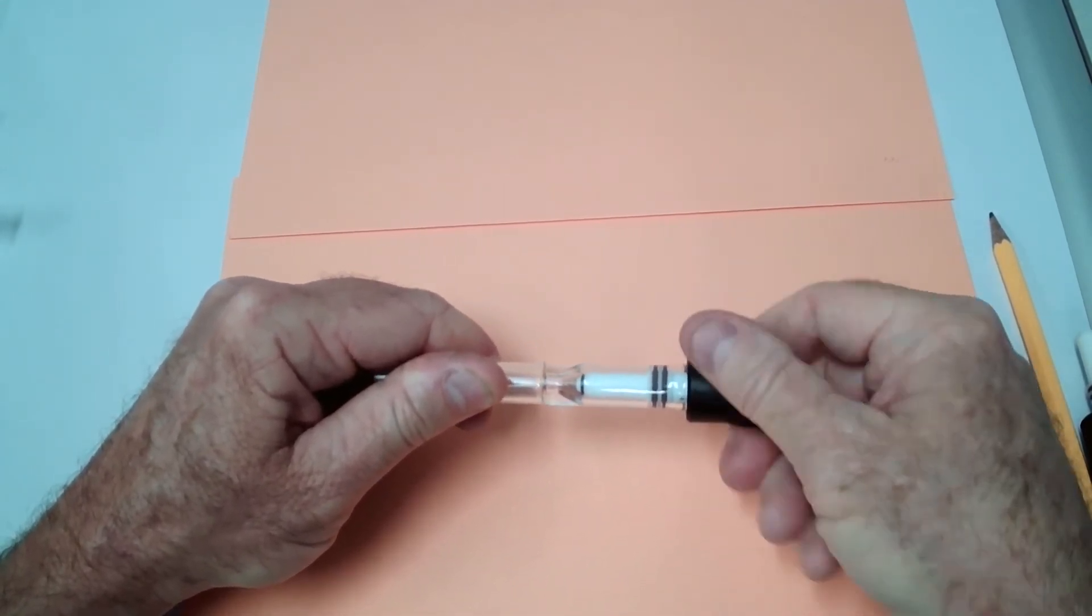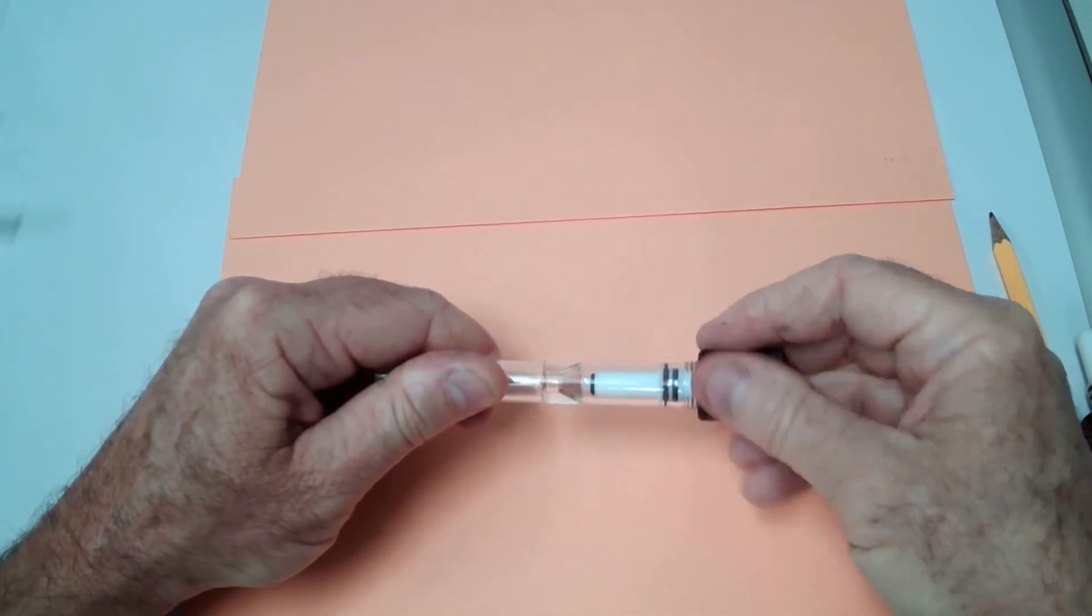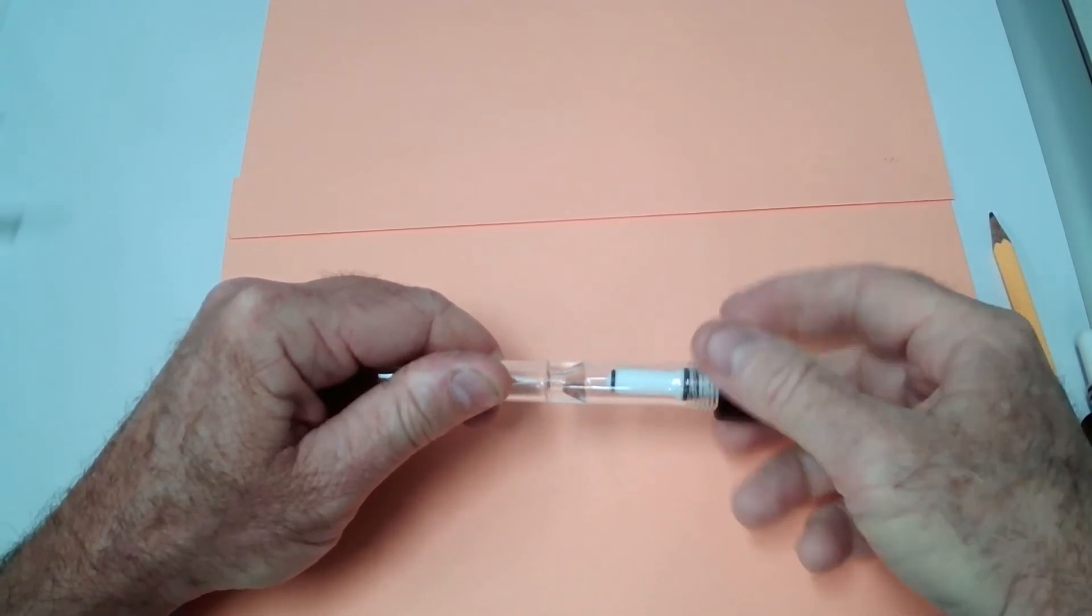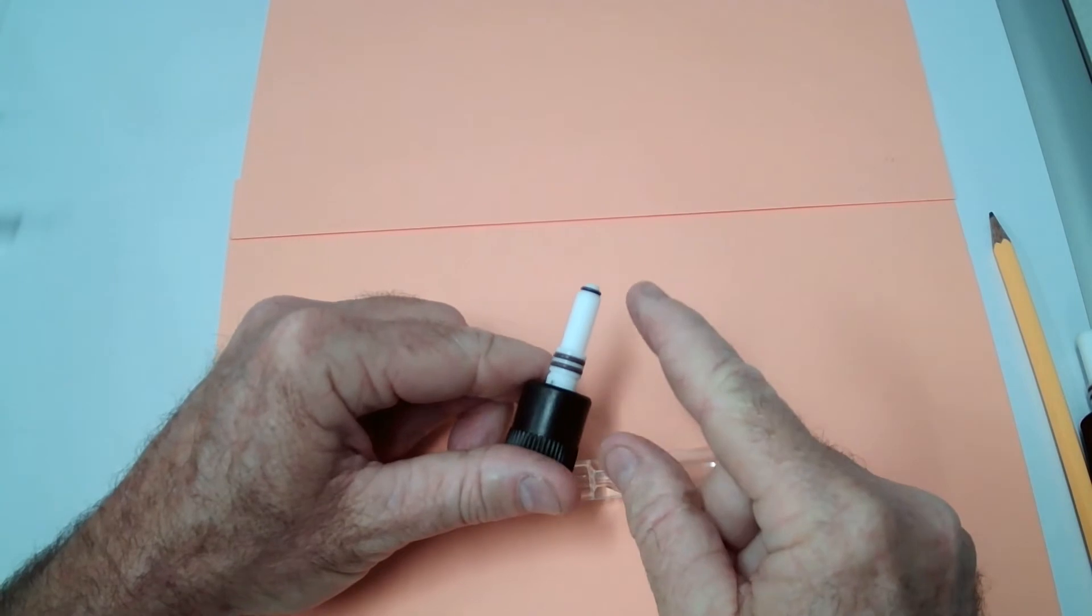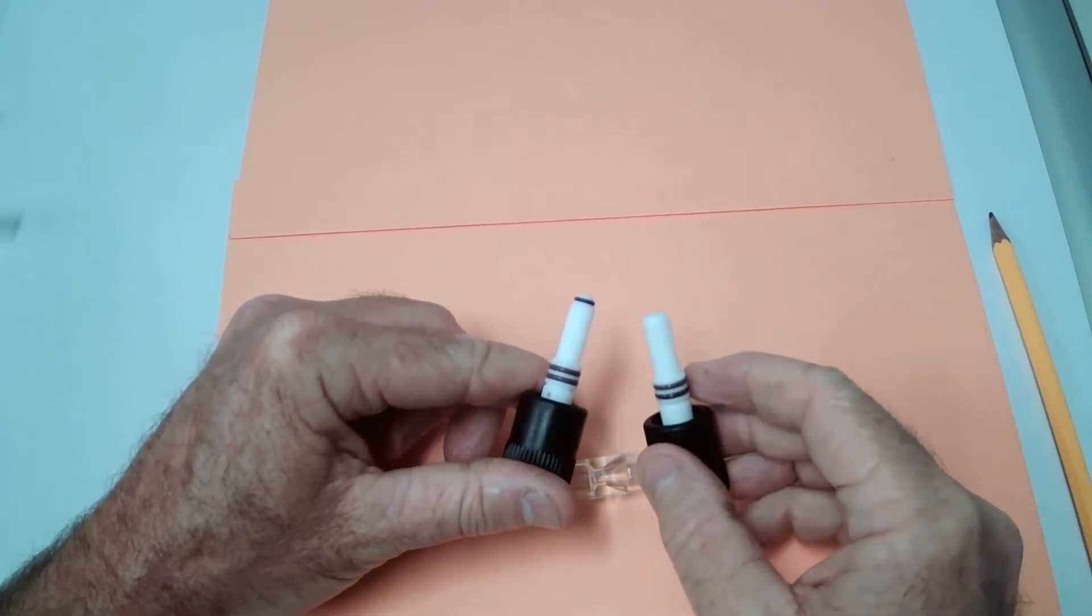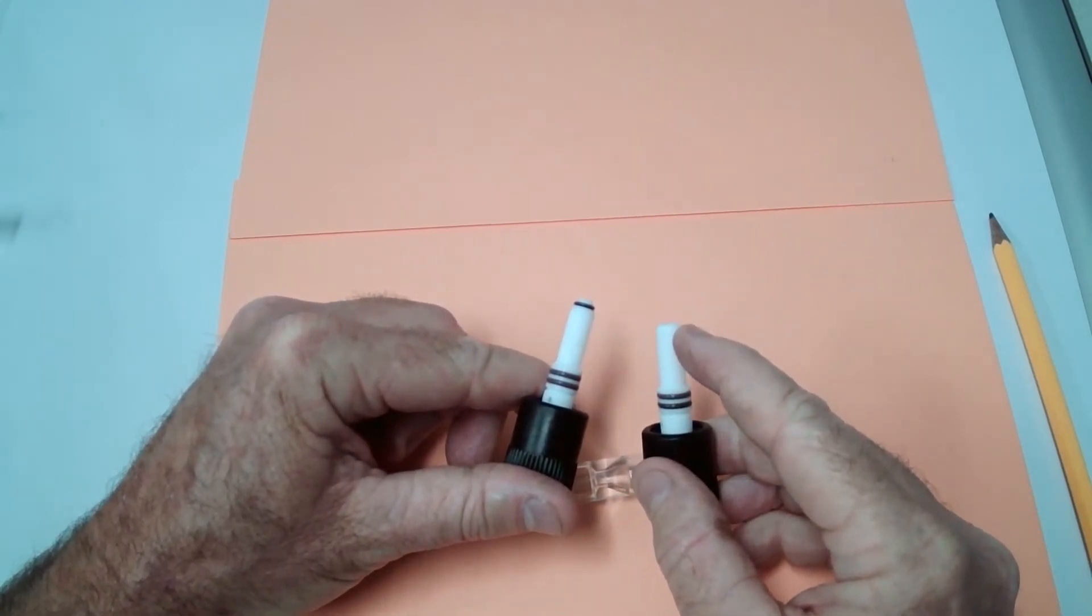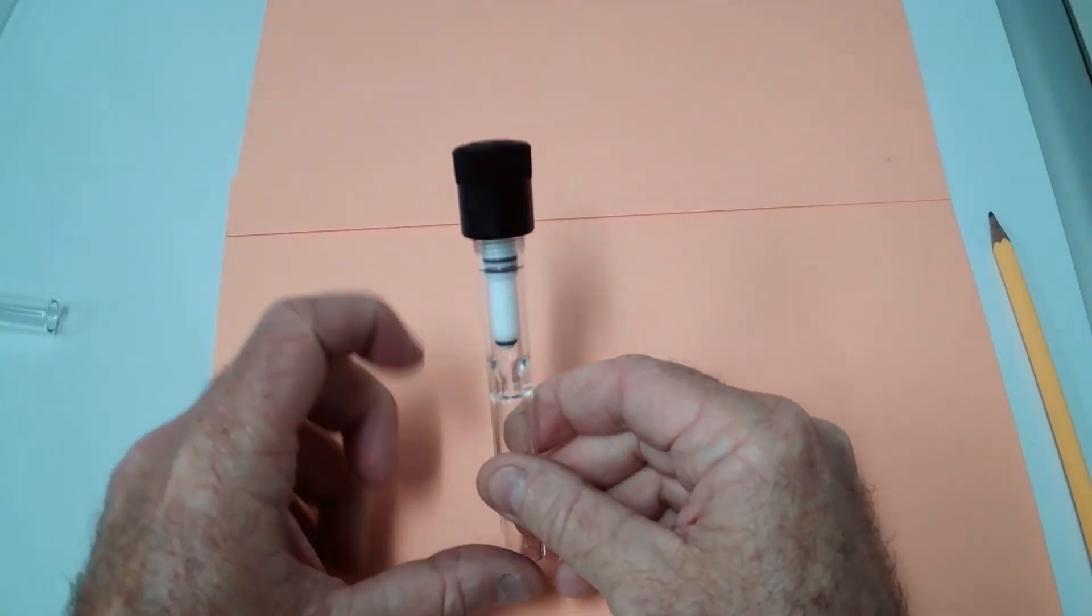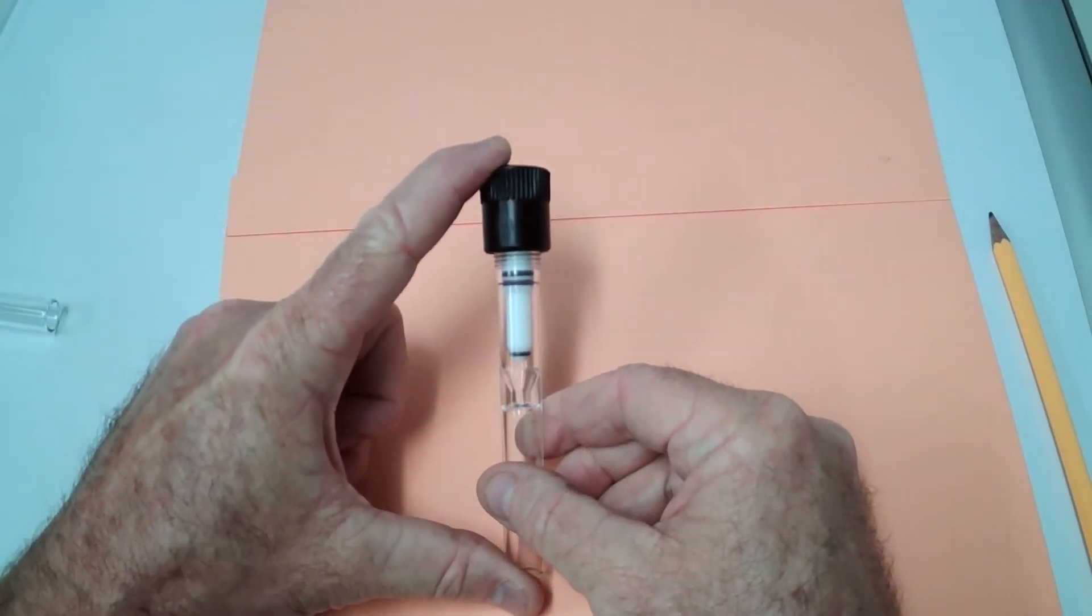Another type of valve plug that is used is one that does not have the Viton tip or the O-ring. It has a plain Teflon tip. This is the basic portion of the valve.